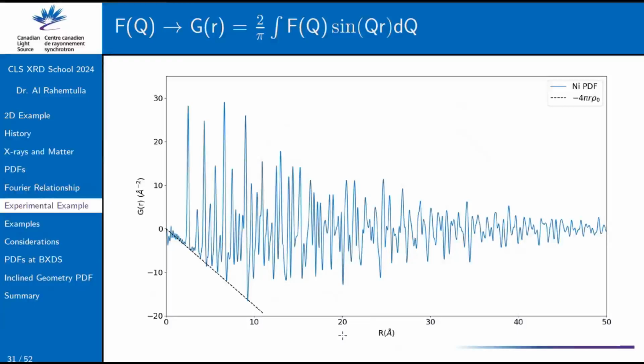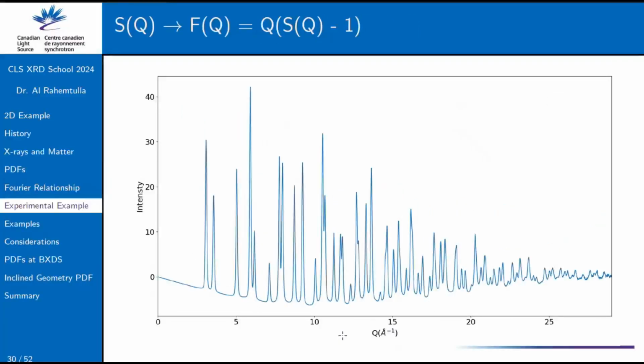And also at the higher R region, we can see stuff that looks like peaks. So, at least in this case, there is still stuff here. I don't have a slide here where I go out really high, but a good example is in QC, where you'll see something analogous, where things start getting noisy. You'll start seeing that at very high R, where the statistical noise also starts playing a factor, and lines almost start looking thicker as a result.